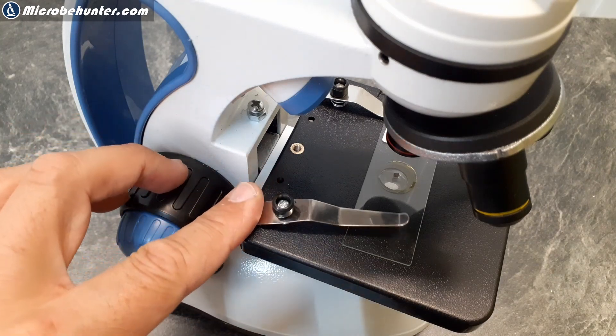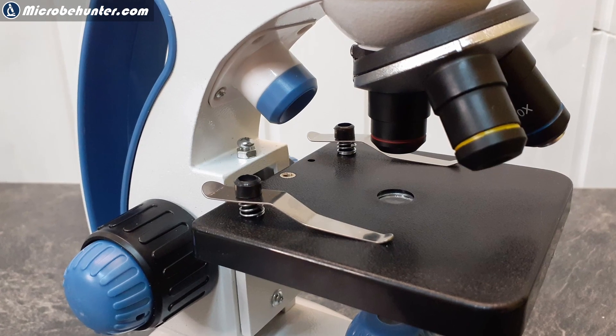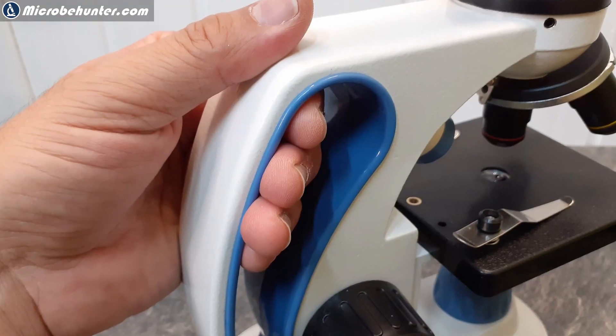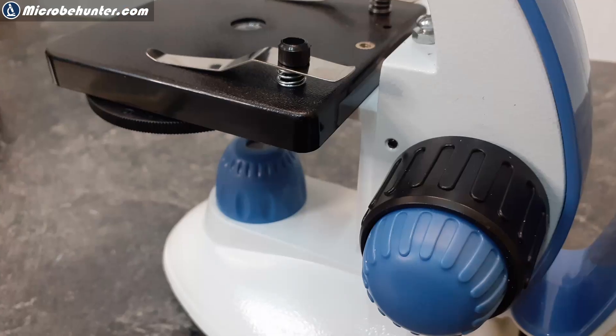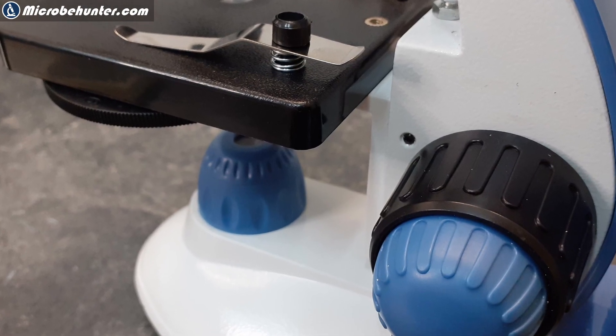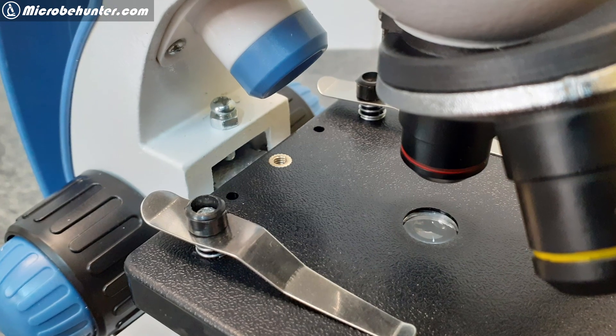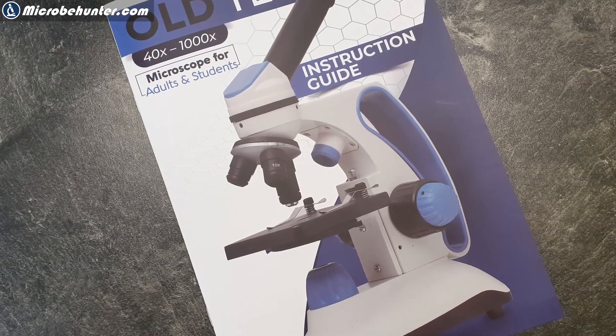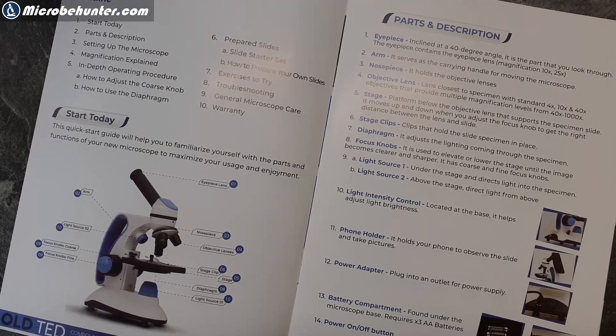There is no mechanical stage. Microscopes at this price category rarely have one. But there are stage clips that hold the microscope slide in place. And this is how it looks like. You can also see that there is a small lens in the center of the stage. And here on the back, there is also a grip which allows you to carry the microscope. And here you can again see the coarse and fine focus knob. And here the lamp, which allows you to look at specimens at a low magnification with light from the top.